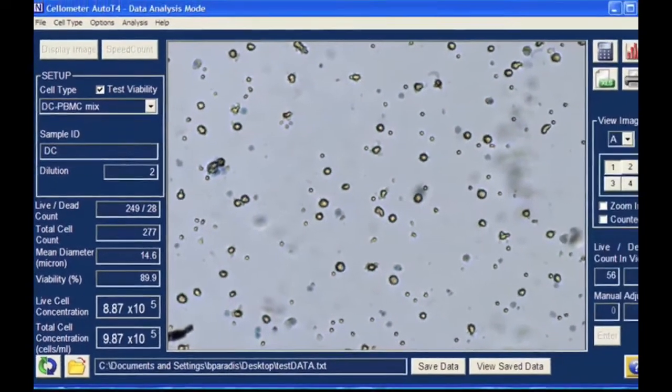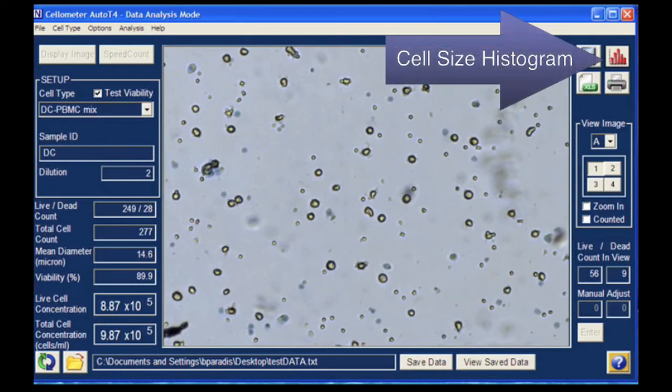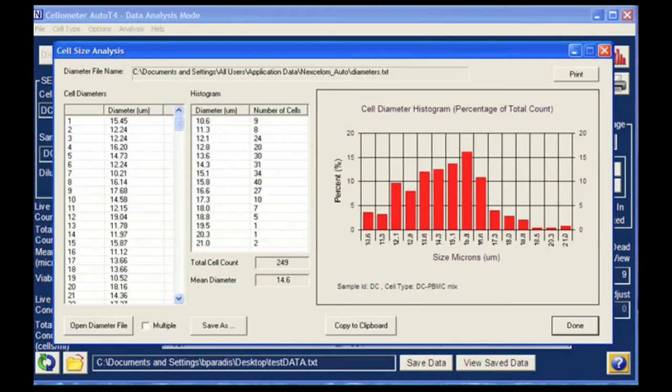The Cellometer software also records the diameter of each cell counted. Click on the Histogram icon to see a cell diameter histogram for the counted cells.